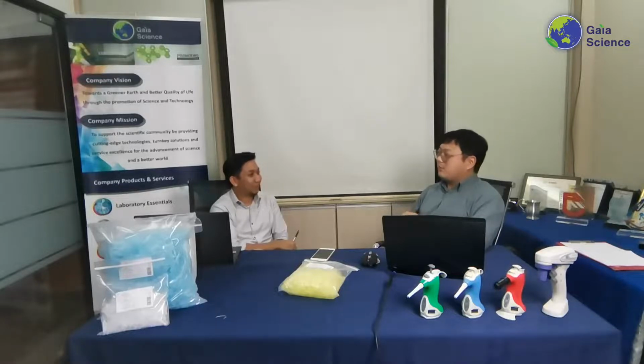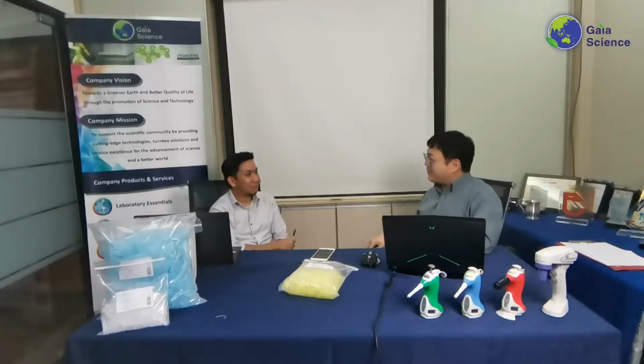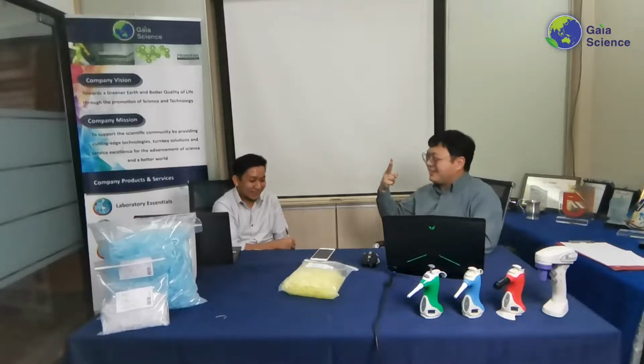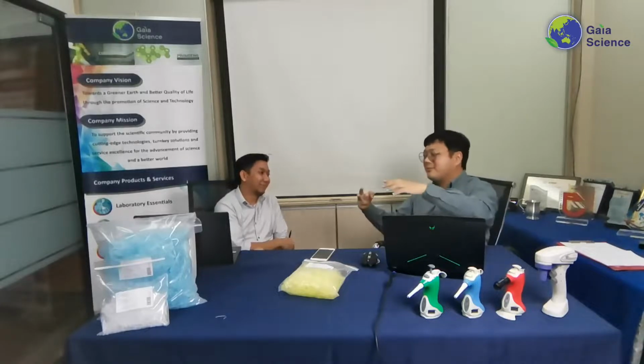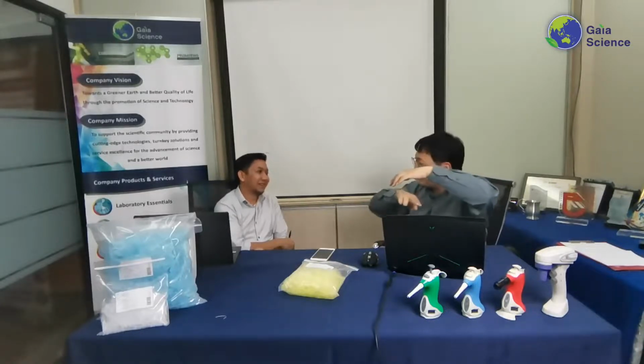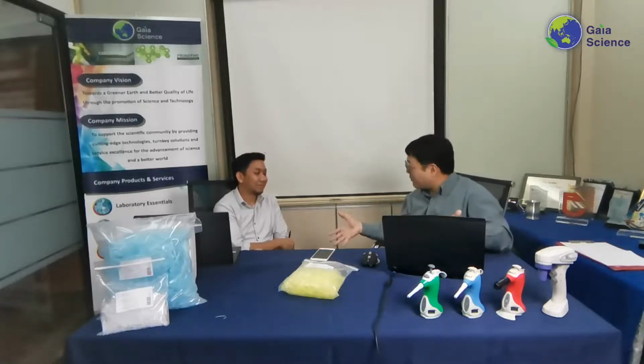Yes and no. You have to remember when you cut it, it's not a clean cut like the machine makes. So you might get a deformed tip at the bottom, and then you might cause way more problems. And again, it's non-sterile by then, because unless you can sterilize your scissors, that's one. And in the biosafety cabinet, you have to cut every single tip, and by the time you cut, you need to autoclave again. So that's another set of problems as well.